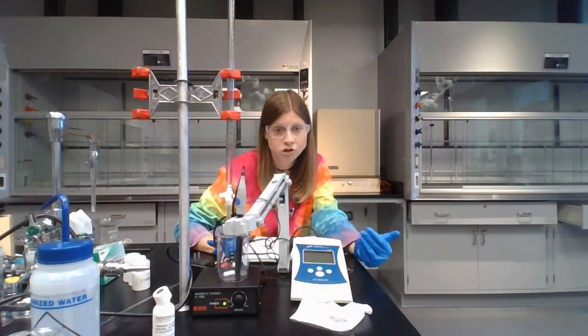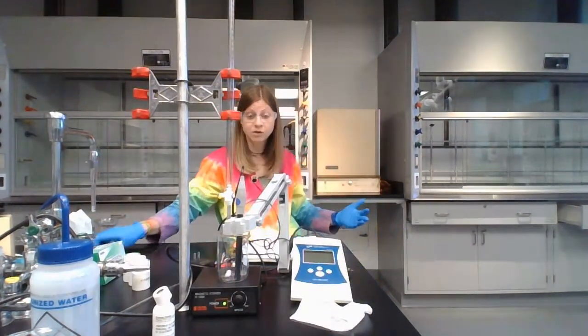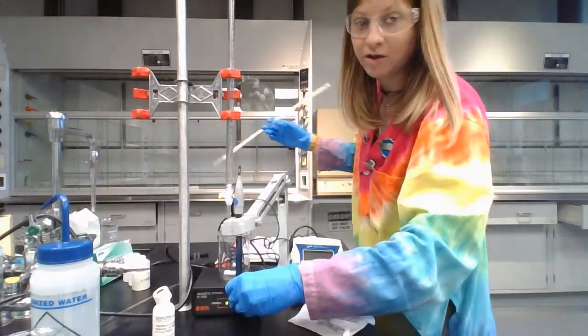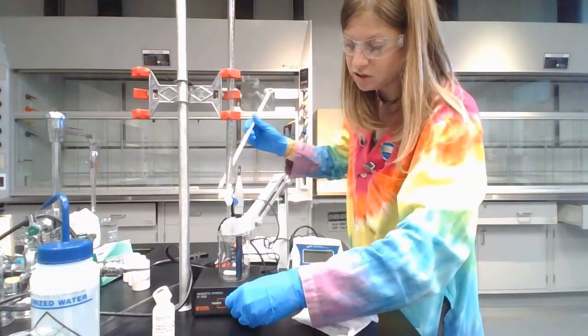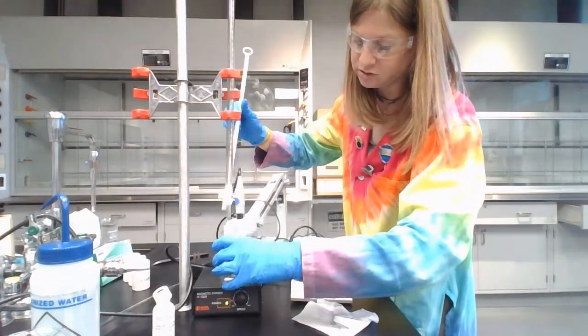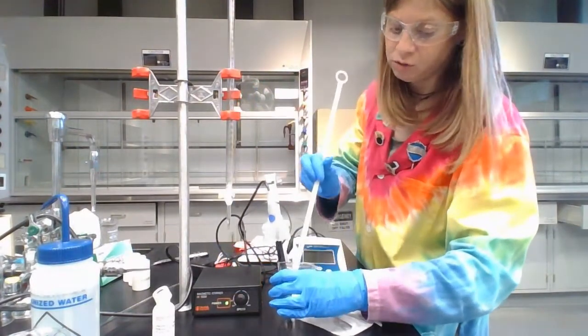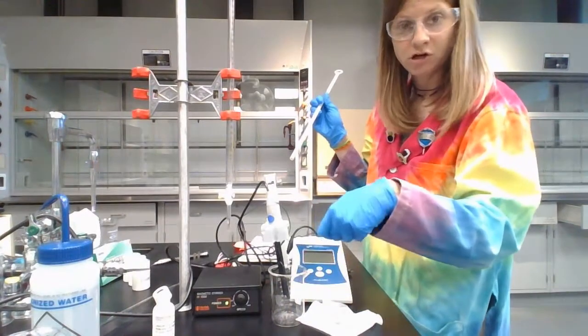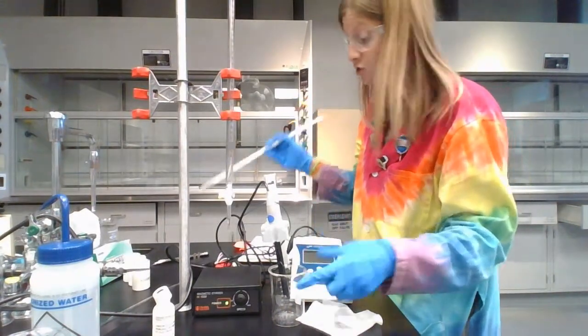Get yourself your trial 2 beaker and get ready to go. You'll have to remove your stir bar, because you'll only have one stir bar since you'll have to check that out from your instructor. It's on the stir plate, and of course it will not behave, so remove it with the magnet stick, put it in beaker number 2, and get ready to start again.